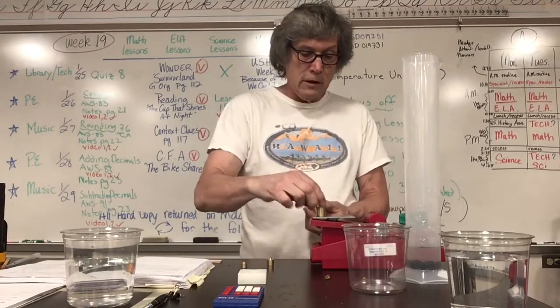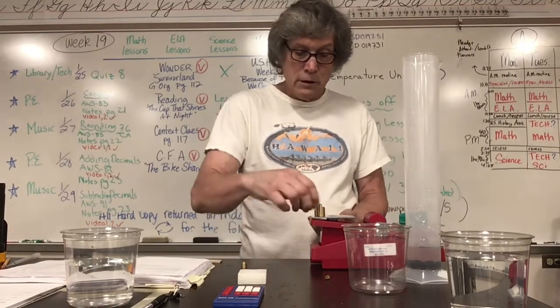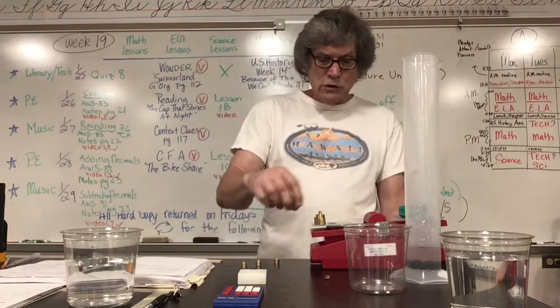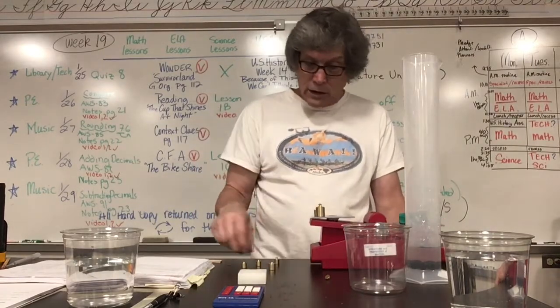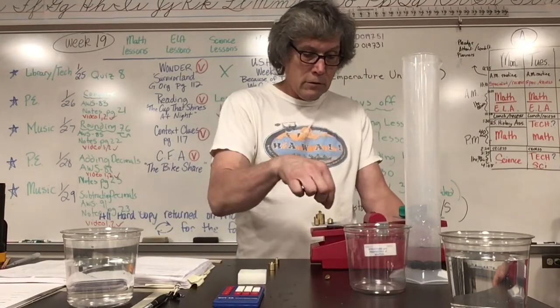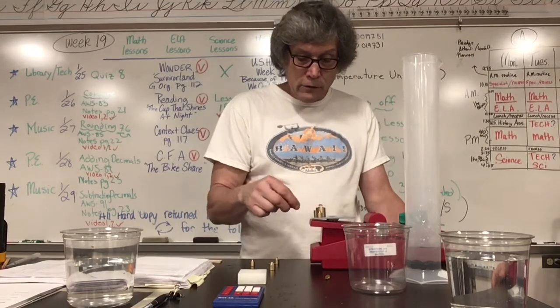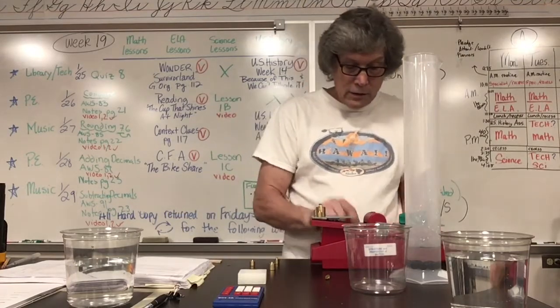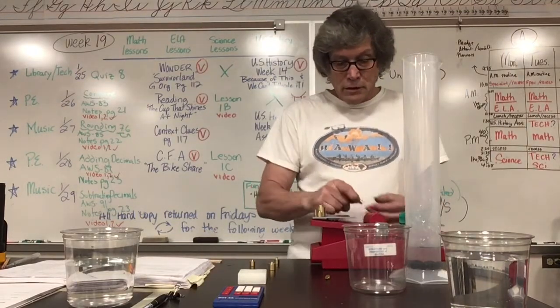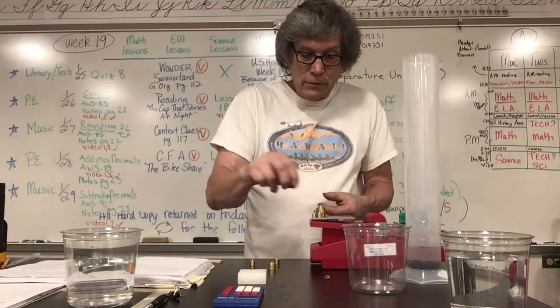We have 50, 100, 120, 140. Okay, now we're getting somewhere. Too much, so let's take off a 20 and try some 10s. Okay, good, so that shows that it is in between. So let's see this, 120, 30, we have a 5. You probably can't see this from home, but the weights are on the weight itself. You'll see a little number on there.